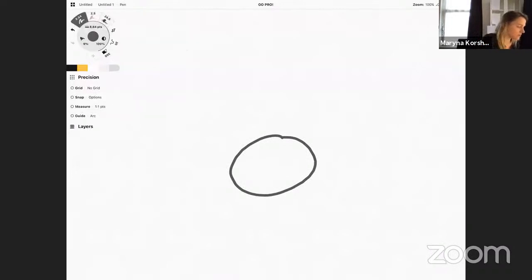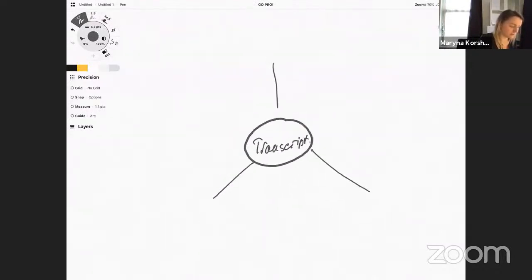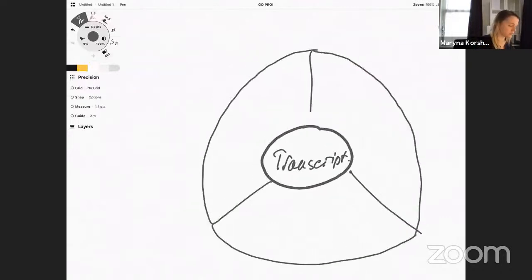You will see that single cell transcriptomics could be integrated with three main different modalities. First of all, the most obvious: by studying single cells and doing sequencing, you might also go deeper into genome sequencing.